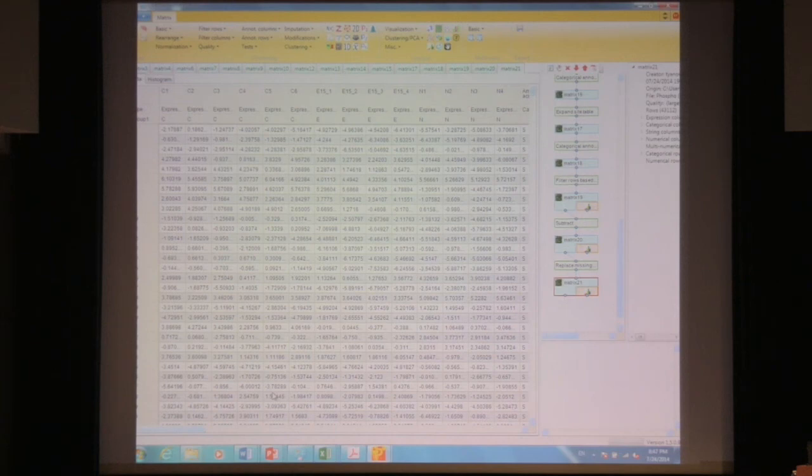Yeah, so it's possible already now, because after you have done your testing, you can set the imputed values back to NaN, right, and then you will see that. Oh, that's good, yeah. So we have here in imputation, replace imputed values by NaN. So now if you go and do that.